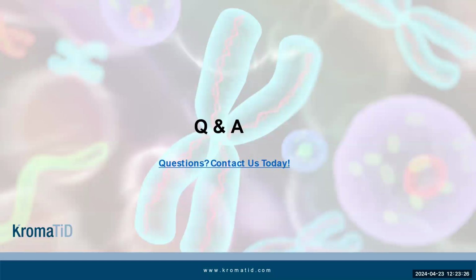Next question. I'm wondering how variable the efficiency of analog incorporation is among the different cell lines. Additional question, is your assay targeting only dividing cells? So that's going to be a yes on the dividing cells for DGH. And would you like to take that?